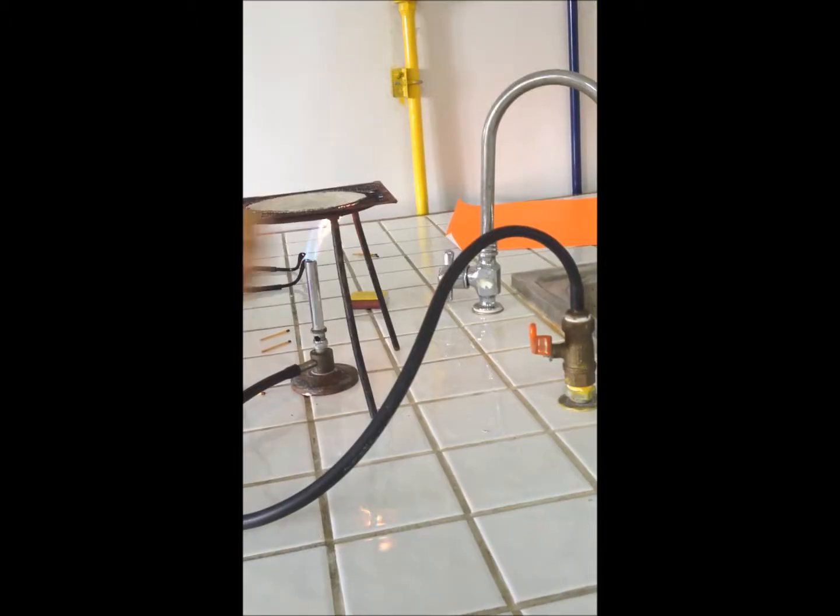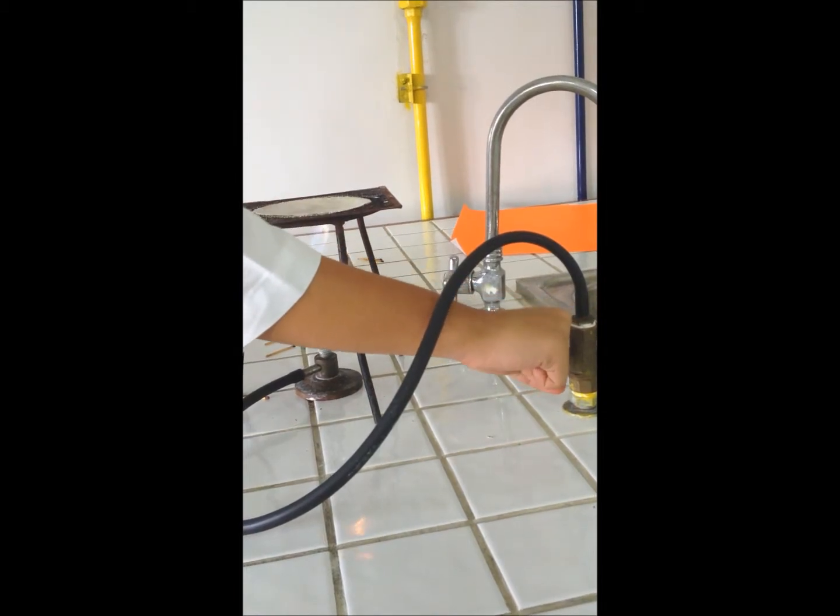How to turn off the Bunsen burner? It's simple — you just need to shut the gas tap off.